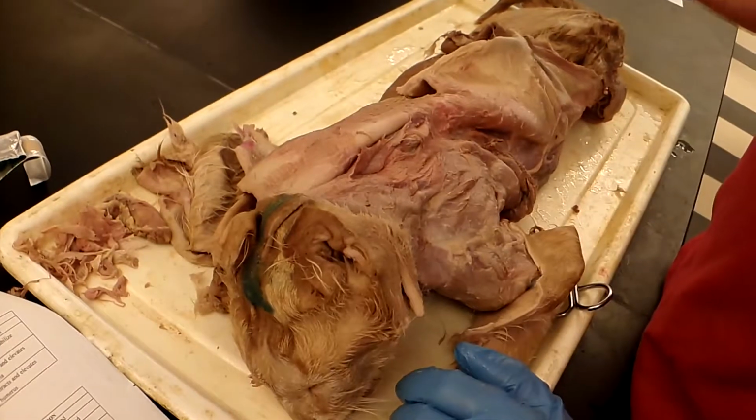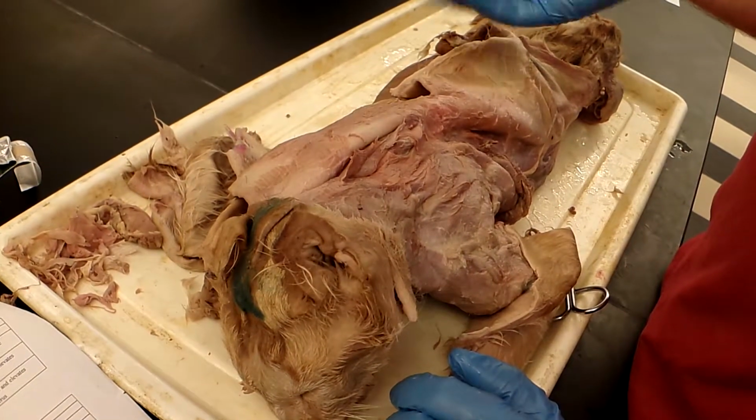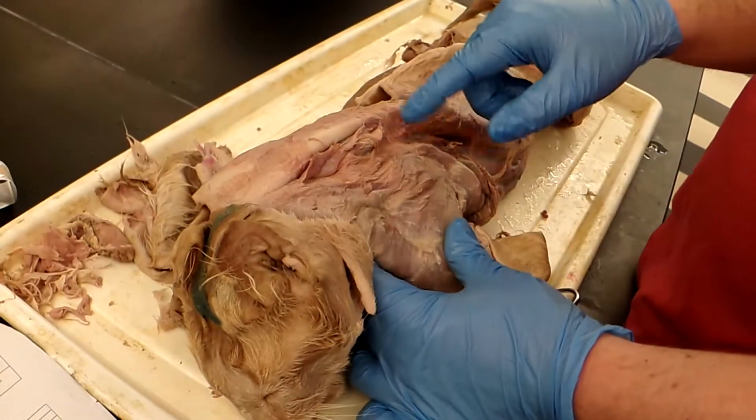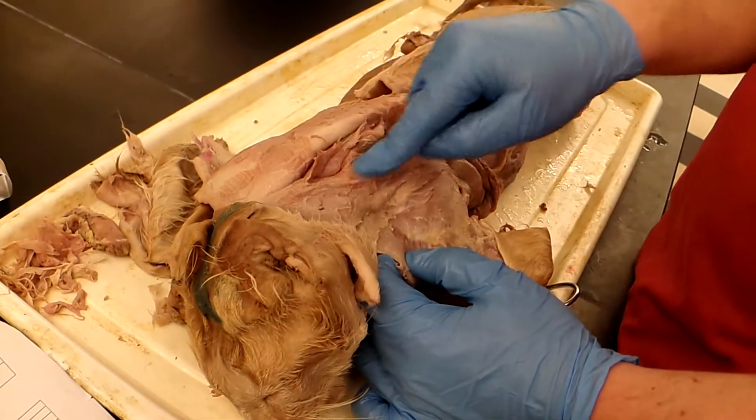Next is the acromiotrapezius, which is right behind the muscle, and it's located right here.